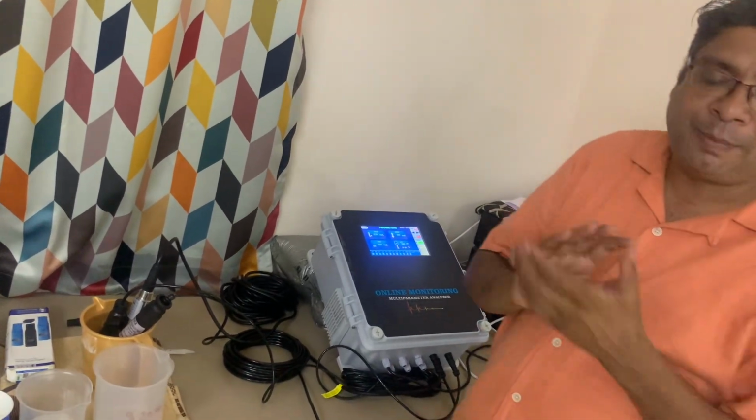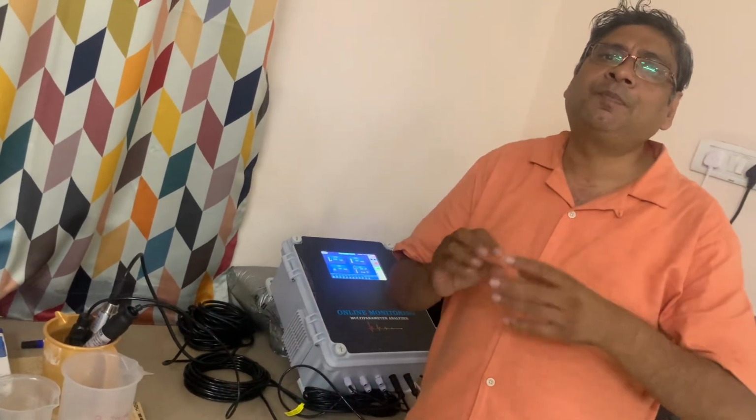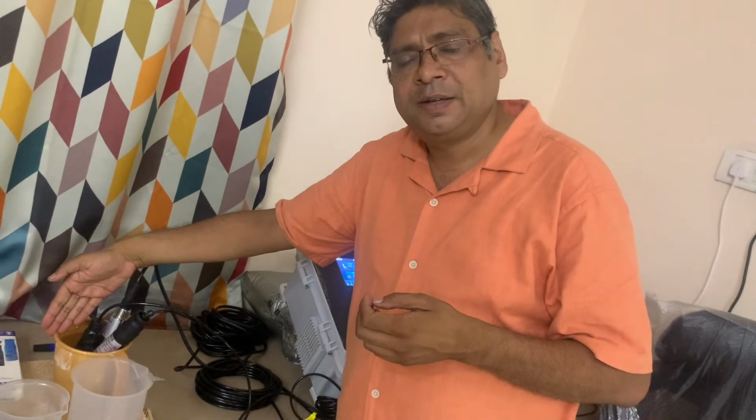Now we need to calibrate it. So what do we have to do? First we will dip it in the 4 pH standard solution. Then we will dip it in the 9.2 and do the 2-point calibration. And then we put it again in this beaker, and we will see the actual pH value.